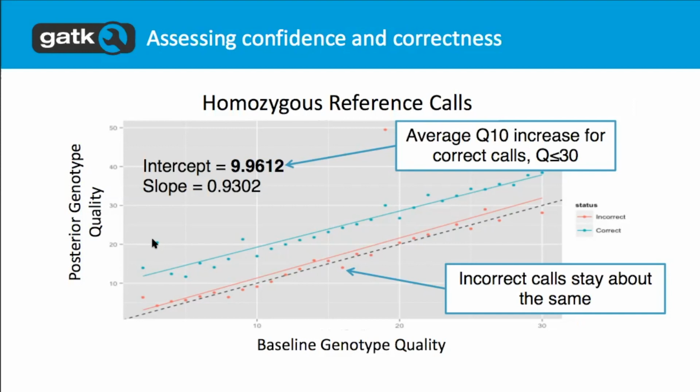And we found that basically what happened was if there were calls where we just didn't have good data in the sequence and we didn't have good supporting information or accurately helpful information from other sources, those confidences tended to stay the same. So we tended not to touch them. So we weren't damaging our levels of confidence. But where we had useful information that actually helped, there we increased our confidence.